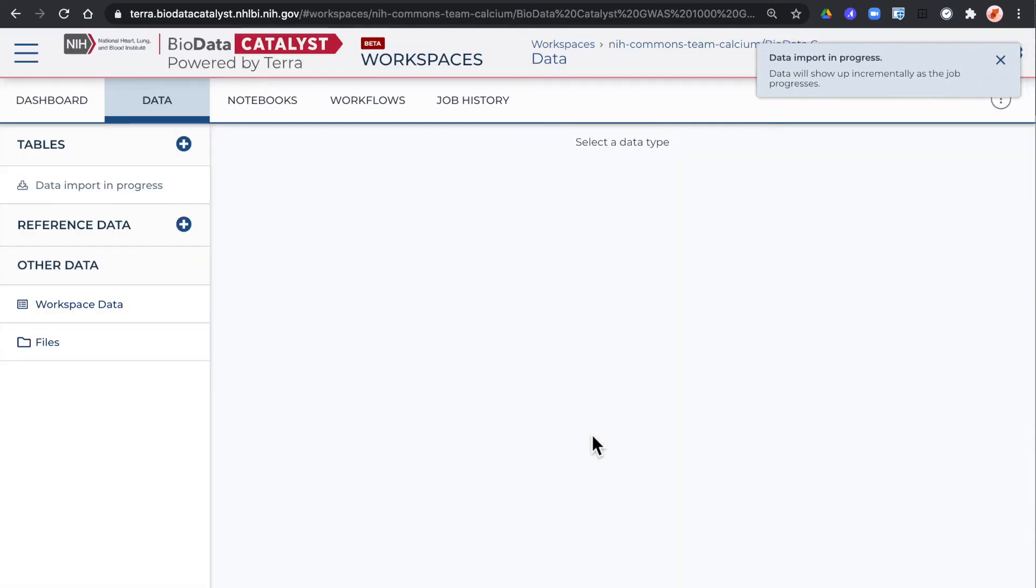Terra will redirect you to the data tab of the workspace. You'll get a banner while your data is being imported. This could take a few minutes.